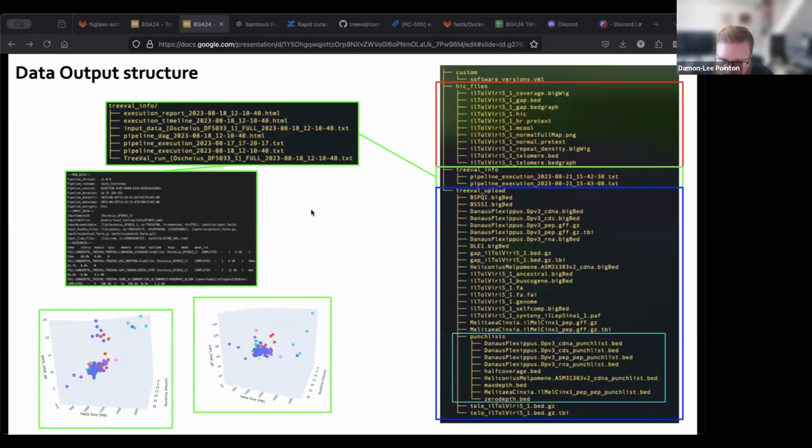So another one from Sam. The basic principle of gene alignment is not to make a heat map adjustment on high coverage protein, cDNA, RNA alignment, correct? Yeah, I don't think the curators are making changes on the heat map based on information from the alignment, but not exclusively. Yeah, so currently our curators are mainly looking into a punch list.